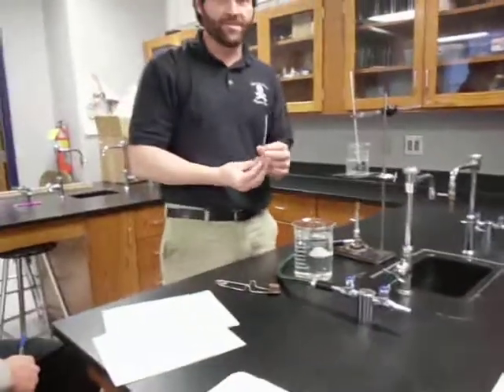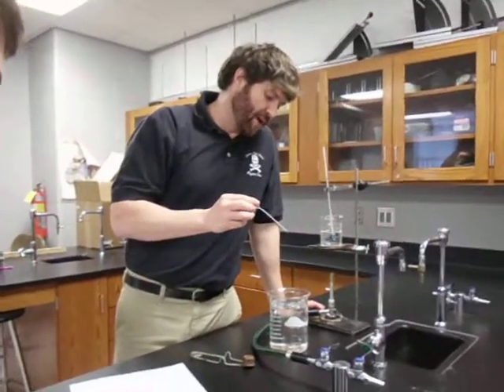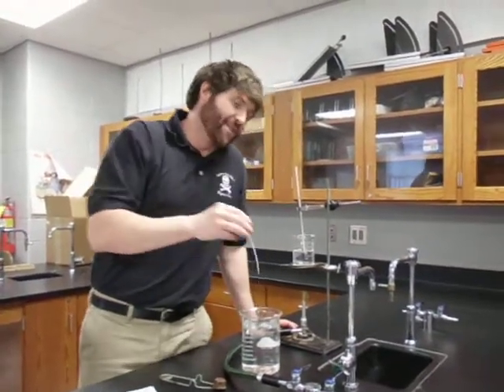At this point, someone in your lab group is going to have to start counting — 1, 2, 3... all the way up. I'm not going to tell you how many drops it should be, but I'll give you a hint: less than 200. It's going to be quite a number of drops.